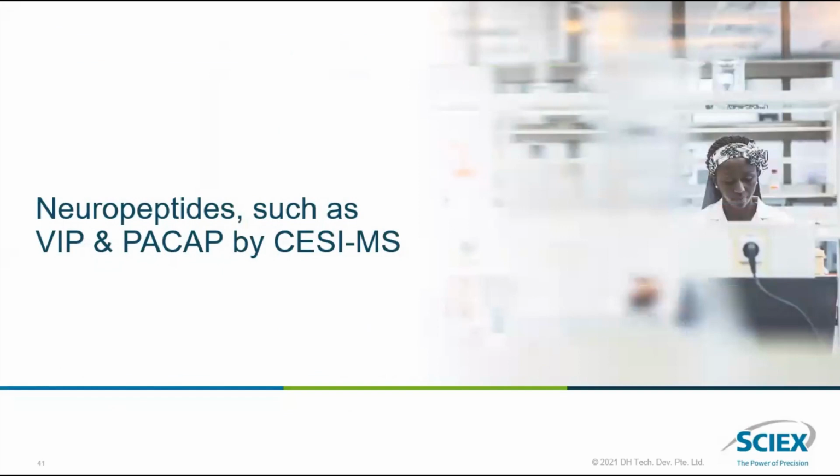So I have a few examples for the CESI-MS analysis, and we will talk about the first example, which is neuropeptides such as VIP and PACAP analysis. This analysis was done by using CESI and mass technology.